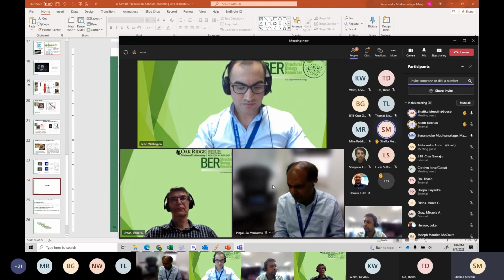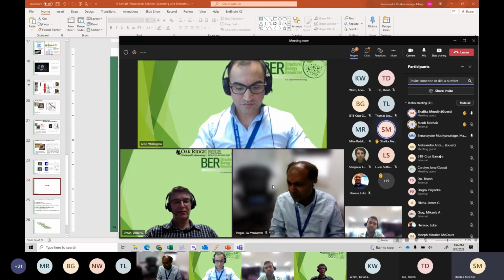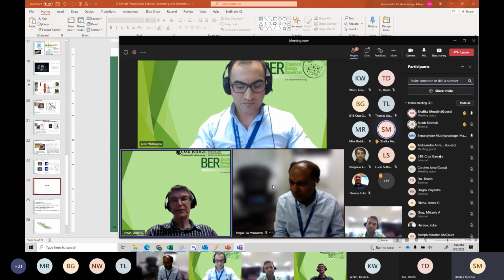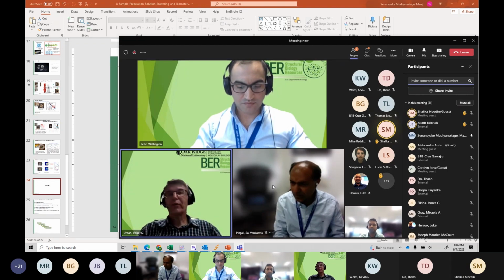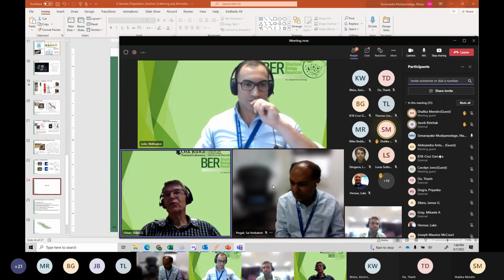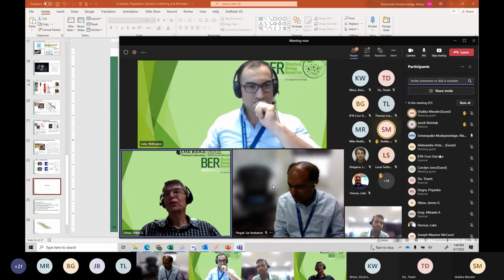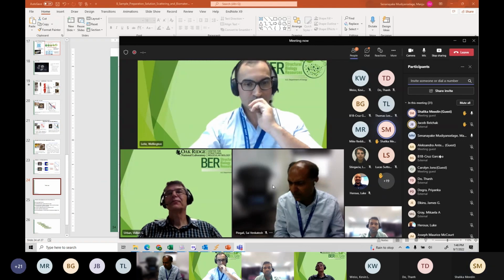So far I got to know how we can do the contrast matching using the isotope. So how you are doing it by doing staining? I can answer that one. Sorry, maybe I went over this a little fast. I was comparing microscopy and scattering at the time. In microscopy you use staining, and in neutron scattering you use isotopes. That's what I was referring to. Okay, thank you so much.